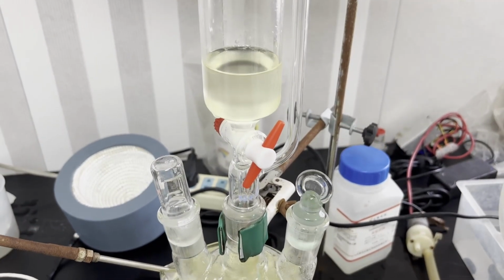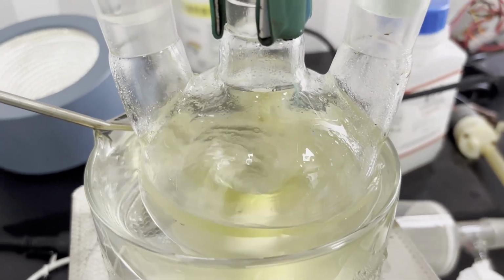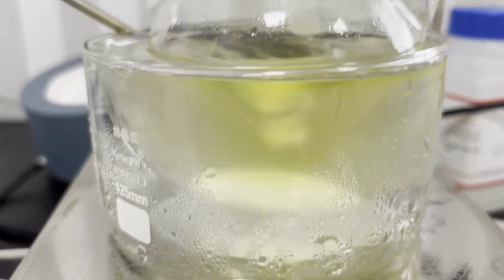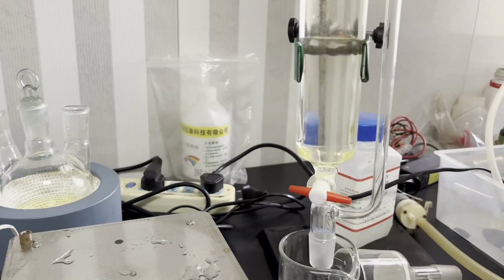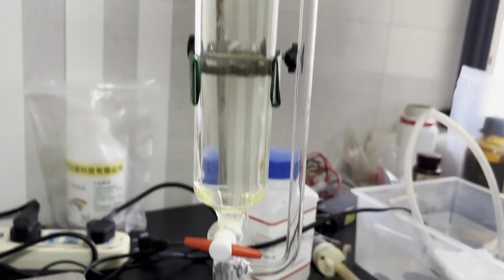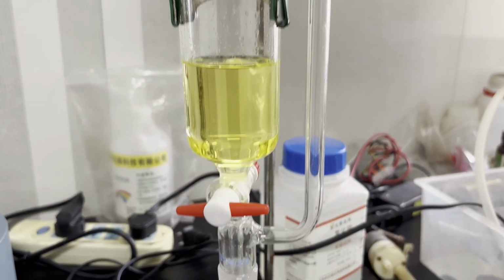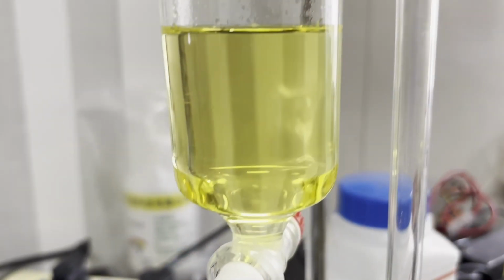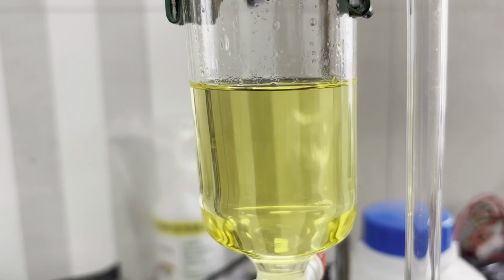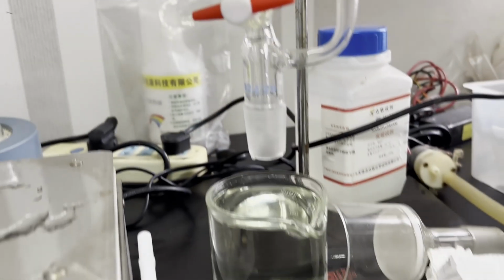After around 2/3 of the acid is added, the cloudy water phase clears up, and the characteristically yellow oil phase of N-butyl nitrite can be seen, confirming that a reaction did happen. The remainder of the acid is added, and the biphasic mixture is poured into the same dropping funnel to separate the layers. The bottom water layer contains quite a lot of calcium chloride and serves to force more N-butyl nitrite to separate out instead of dissolving in the water phase, as well as pull remaining water from the organic phase. This is an advantage, as no more drying of the nitrite using sodium sulfate is required.